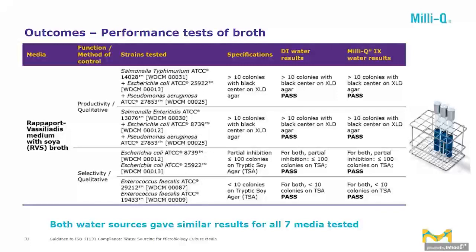Yes. So, just as a conclusion, basically, in all cases, each of the media prepared really successfully passed the performance tests, and we really obtained similar outcomes with the two different kinds of water. What this means is that the water purification system that we tested could be used with confidence to prepare the microbiological culture media according to the standard.